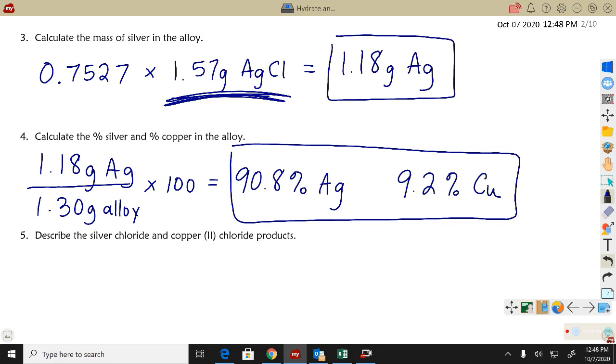Hey, this is not bad data, because guess what? These dimes that I used, they're called Roosevelt dimes. And theoretically, they were made to be, are you ready? 90% silver, 10% copper. No way! That's really good data. I'm patting myself on the back right now. I'm sure you would have done just as well, if not even better. That's fantastic.